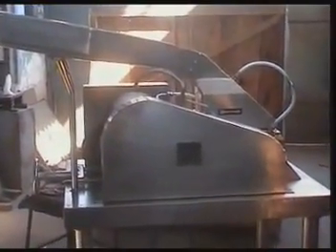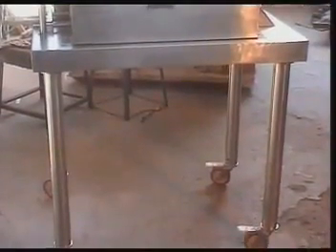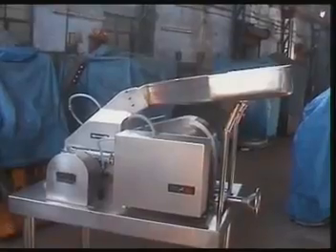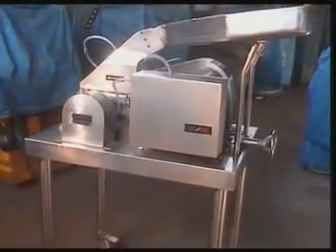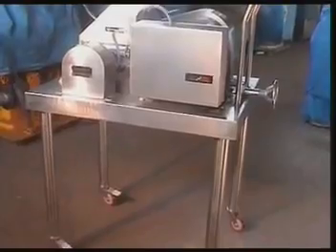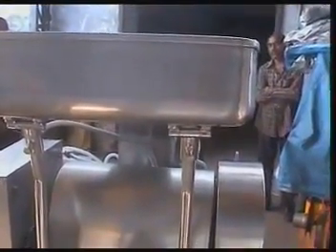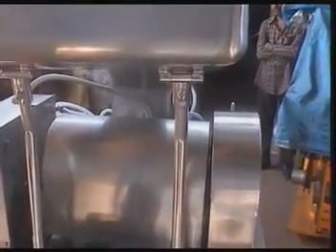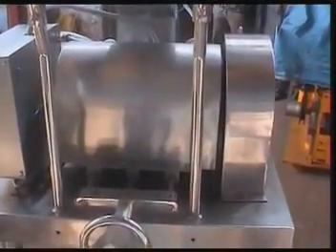This is the side view of the machine. This is the rear view of the machine. This is also the side view of the machine.